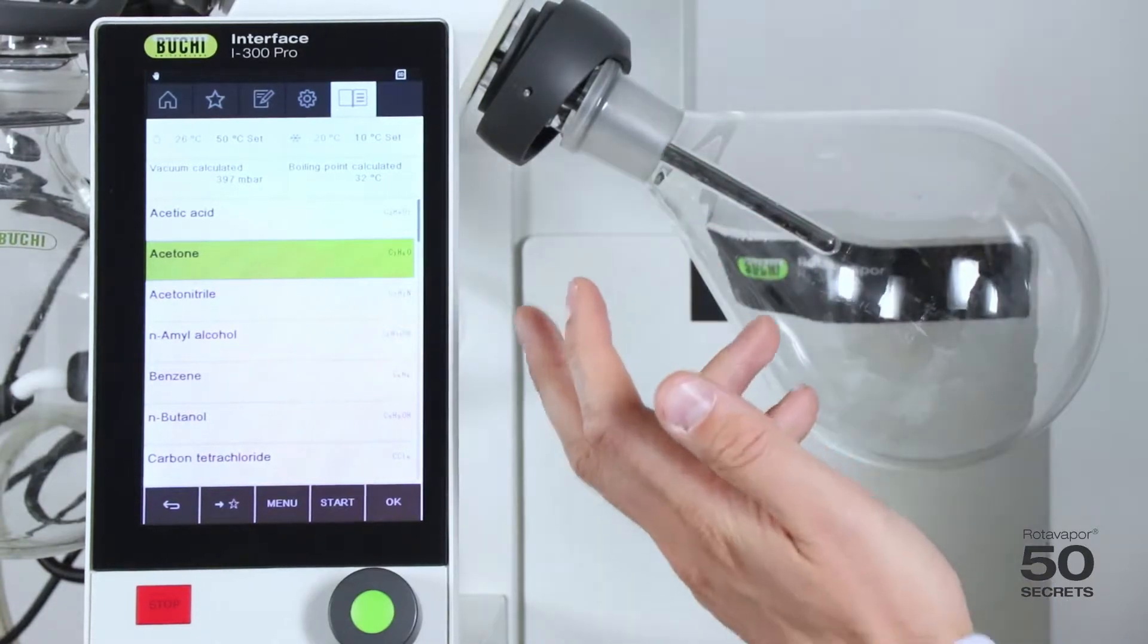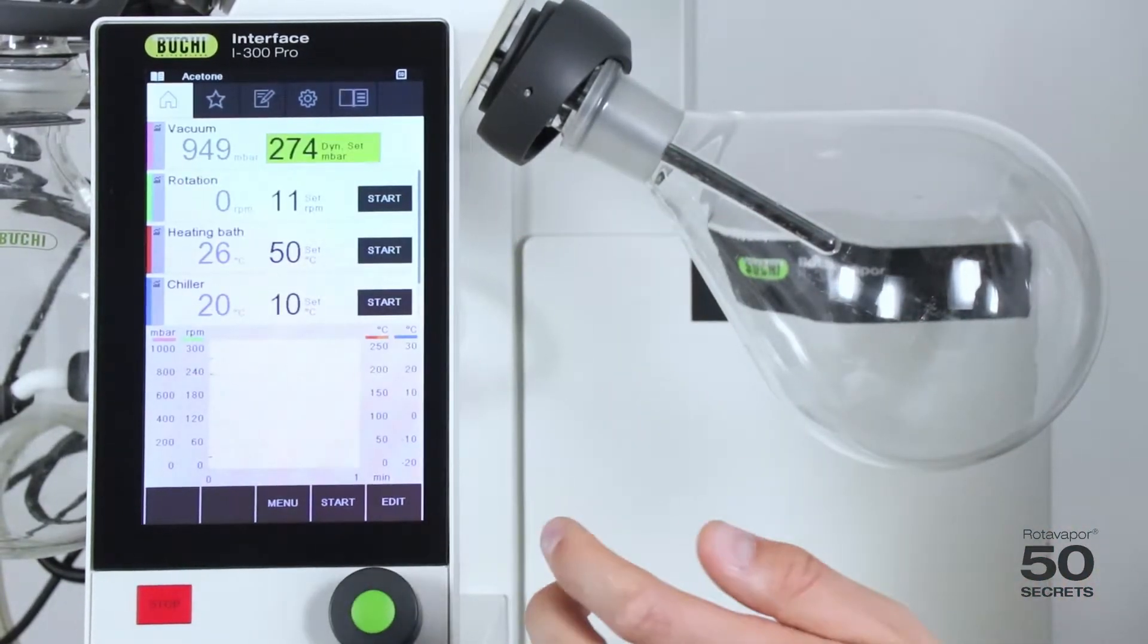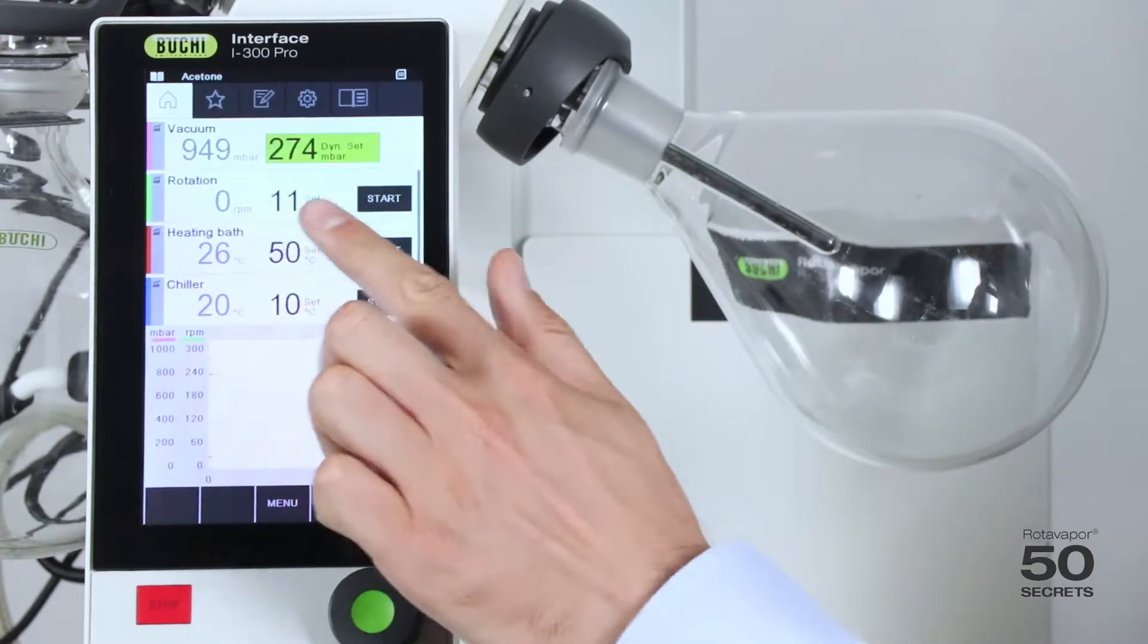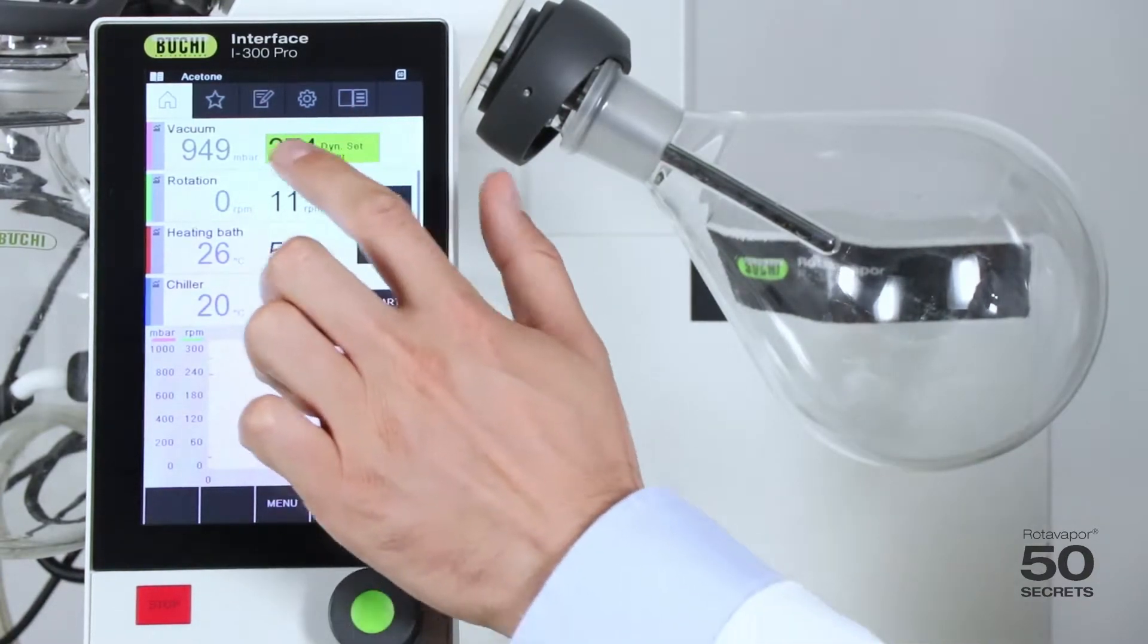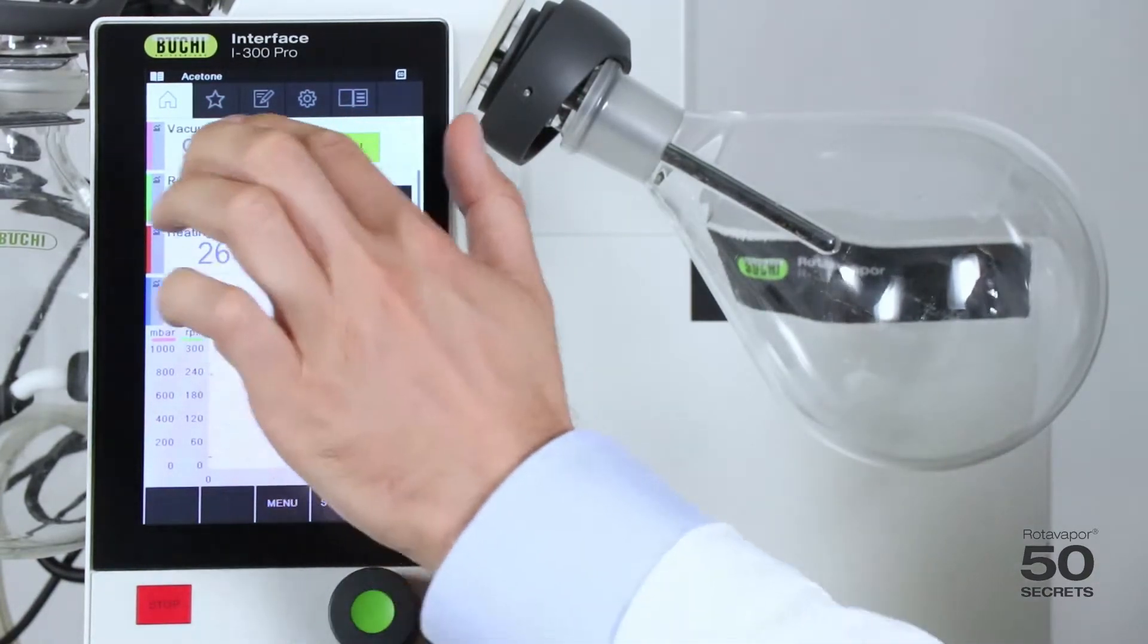Once I am happy with all these numbers I can just press OK. And now it shows over here that we have a dynamically set vacuum.